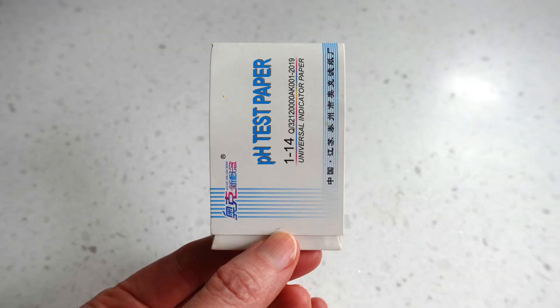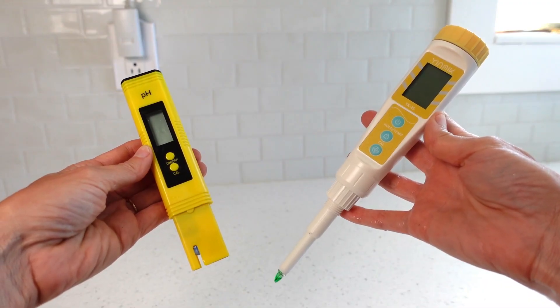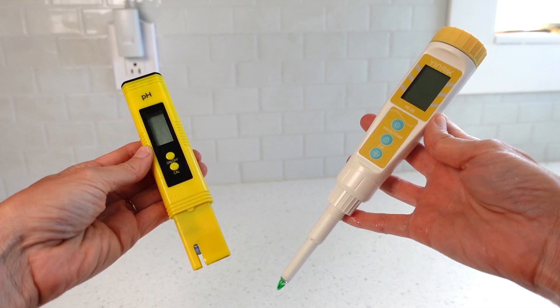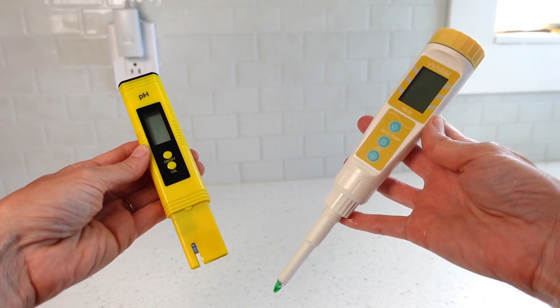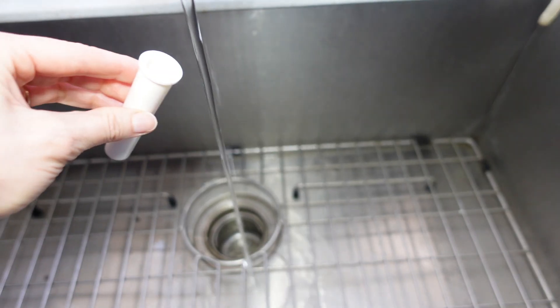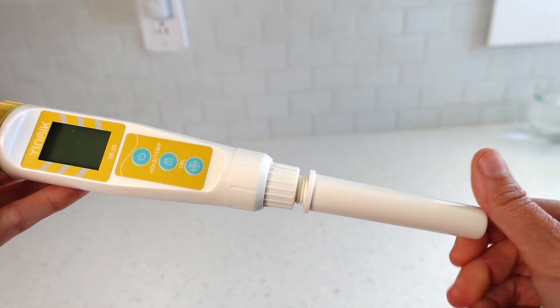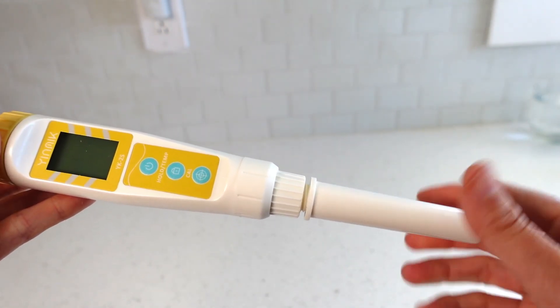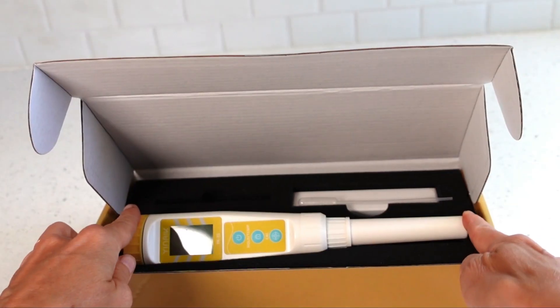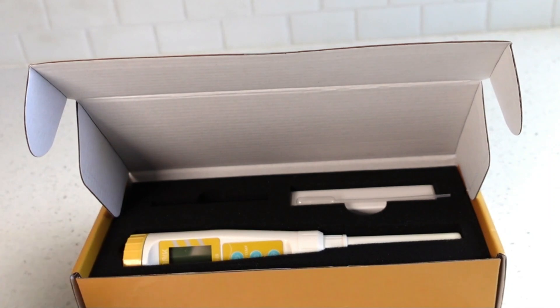With digital pH meters, it's important that the probe does not dry out for an extended period of time in order to continue working properly. For the upgrade probe, inside its cap at the very bottom is a little gray sponge — keep that sponge damp by wetting it once in a while. After rinsing the probe, place the cap on and the probe will be kept moist by the sponge. If you don't plan on using the meter for an extended period of time, keep it stored in its protective box and set a reminder on your phone to re-moisten the probe in a couple of weeks.